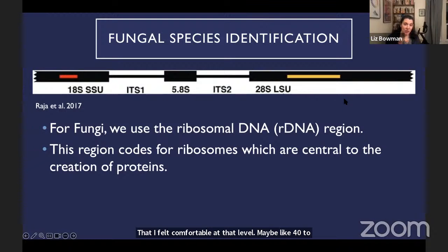So there's a lot of unknowns. Some of them I've identified lower, but you get a confidence score of how confident it is that this is a close match, and a lot of those confidence scores were not very good, so I didn't feel comfortable labeling them. That's a very good question. We need better databases, honestly.